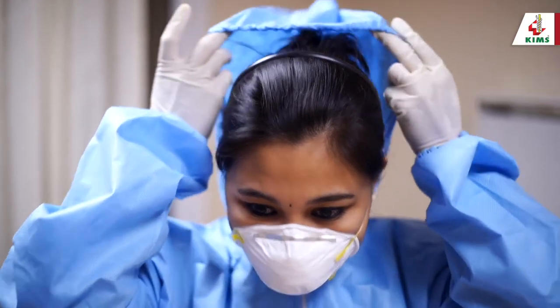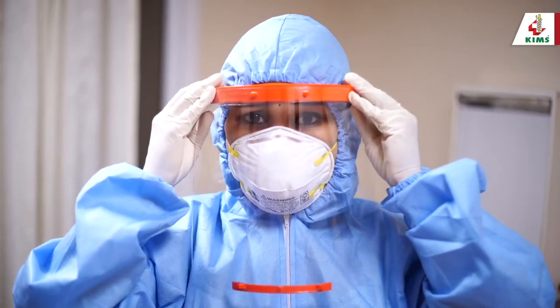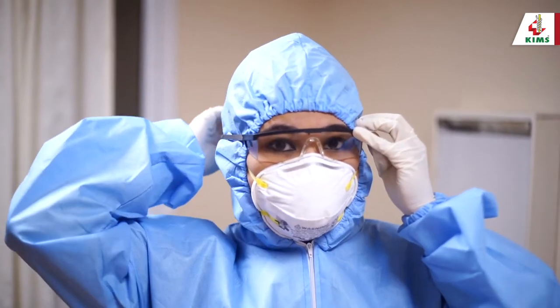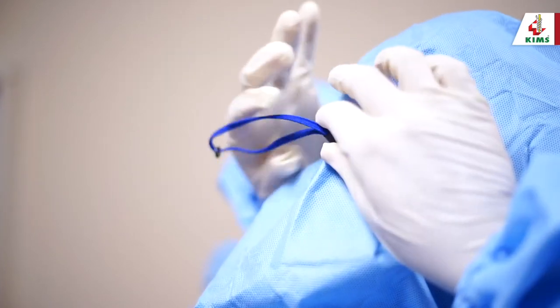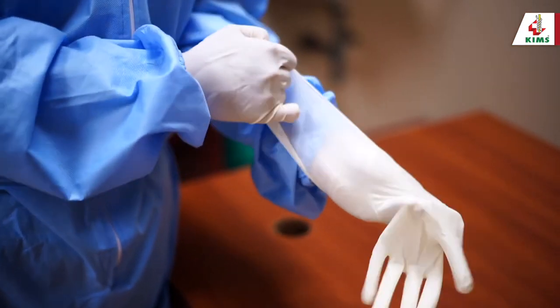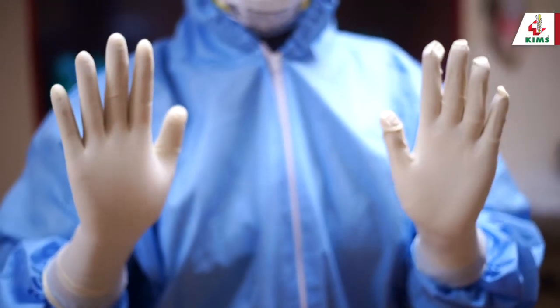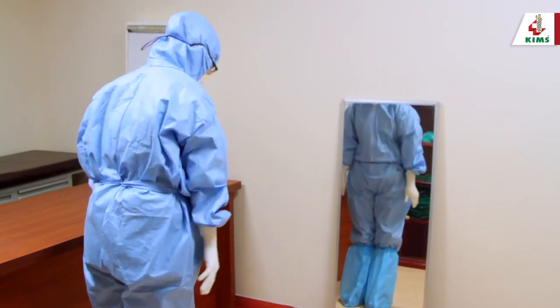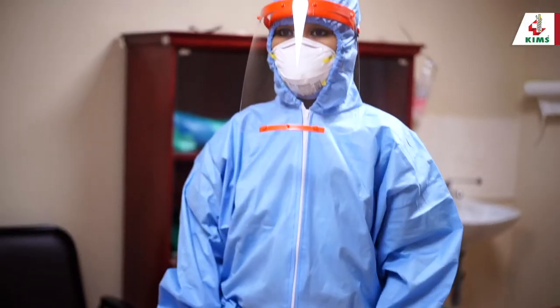Cover the head with the coverall hood. Next, wear the face shield — an alternative would be goggles. If goggles are worn, make sure they fit securely or secure them at the back with straps over the hood, like corrective glasses. Wear the second gloves over the coverall sleeve cuff. Finally, check for exposed areas — no skin should be exposed. Check for ease of mobility before entering the isolation area. Now you are ready.